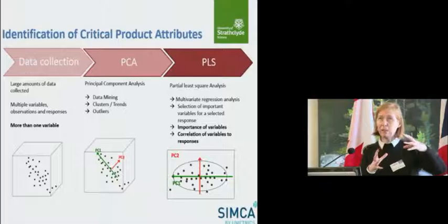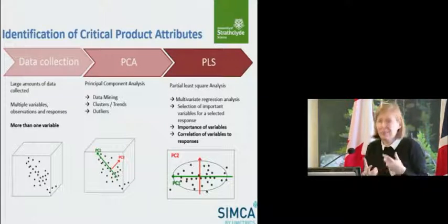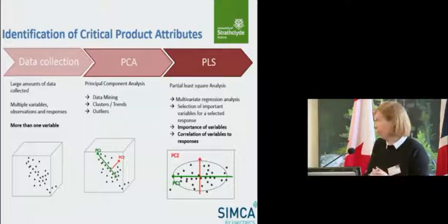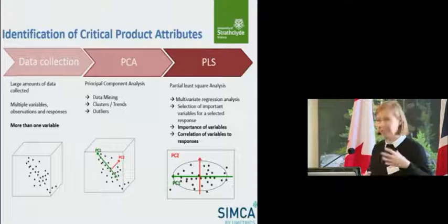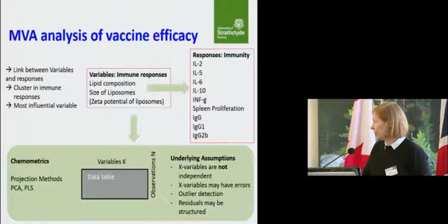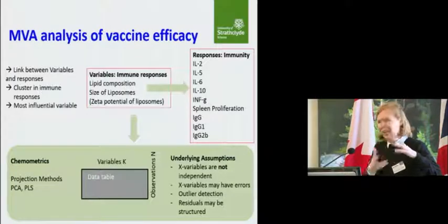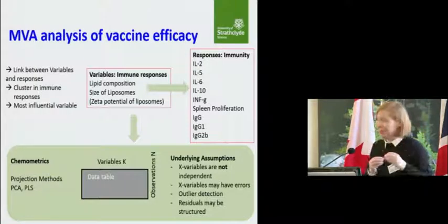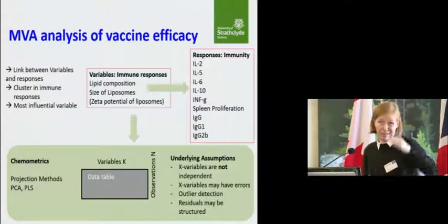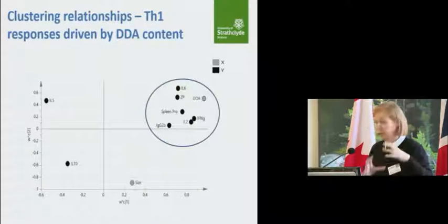So the thing was, we had been working with these liposomes, we're at 500 nanometers, and cationic. We didn't really know if those were the key attributes we were looking for. So we took all our old data from in vivo, and we did a post-analysis MVA. So we basically looked at the correlates of protection. We looked at the usual things, the size, the charge of the liposomes. The charge is obviously directly related to the lipid composition, so those two were quite difficult to pull apart. And we looked at a big panel of all our immune responses, as you can see here. And we basically looked for clustering.